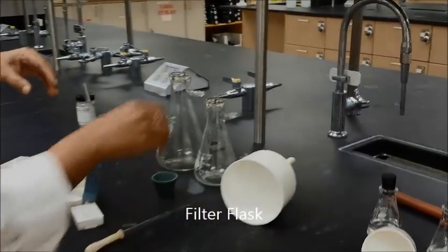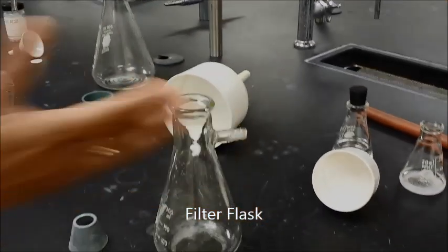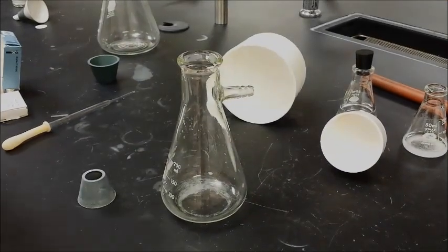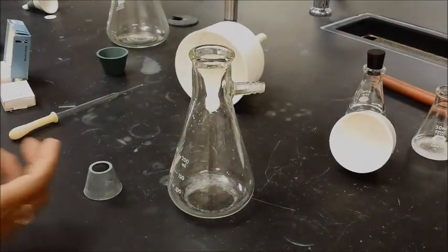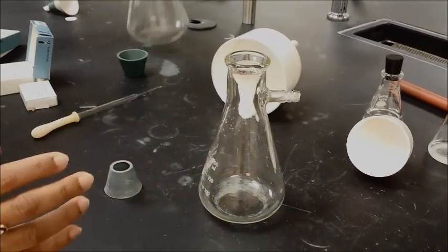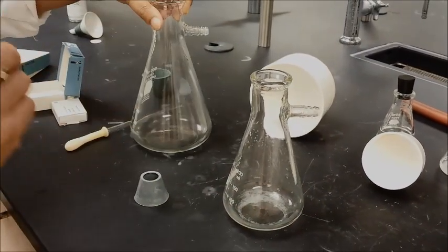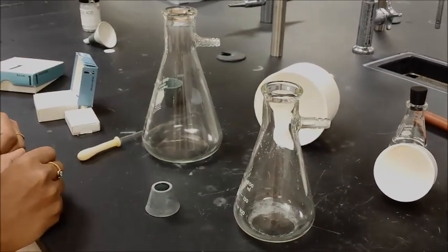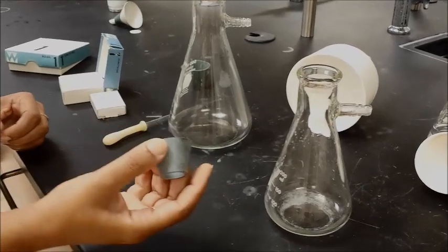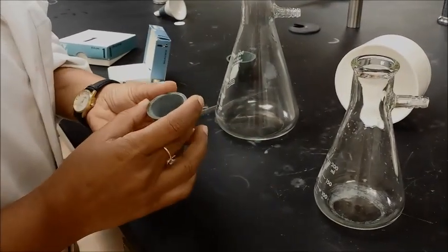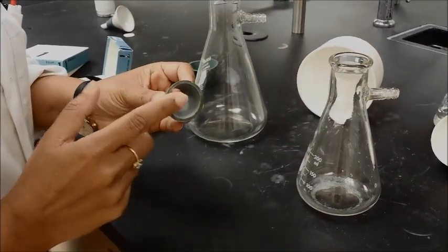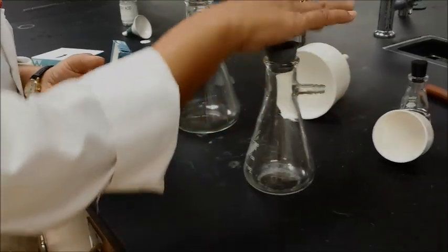So, speaking of filter flask, you will need to have a filter flask. Again, depending on what you're trying to filter and how much of substance you're trying to filter, you can use a small one, you can use a larger one. But no matter what kind of filter flask you choose, you want to make sure that your Buchner funnel actually fits on it. So, for that, you will need this kind of a neoprene adapter.